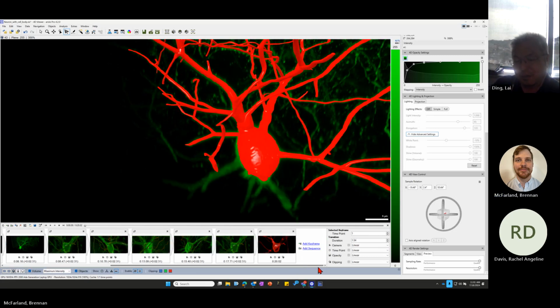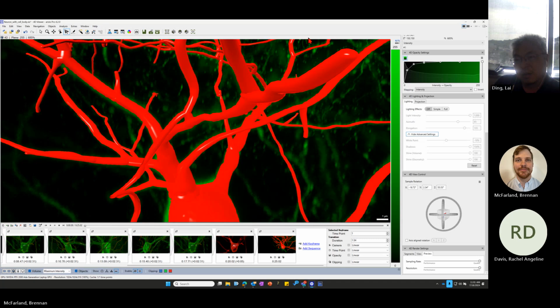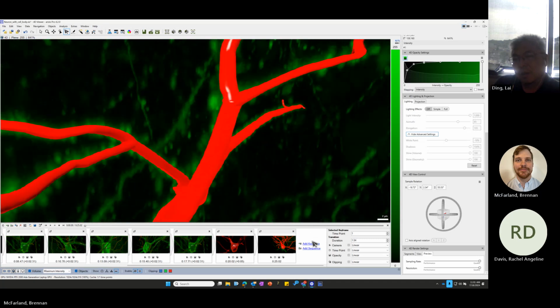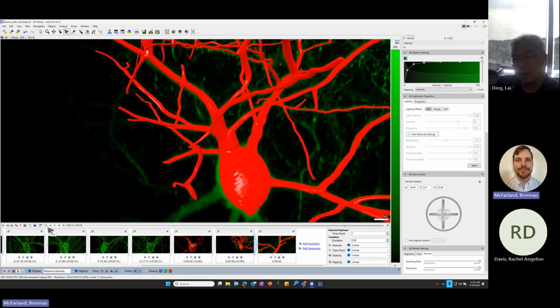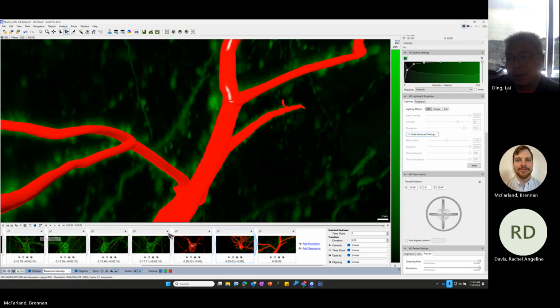So add this keyframe here, and then we would pick our ending point. So if I want it to fly like this, it's going to interpolate that for us. So yes, we can, but we do have to add those individual keyframes, in order for the software to recognize here's point A, point B. Let's figure out the best way to get there.